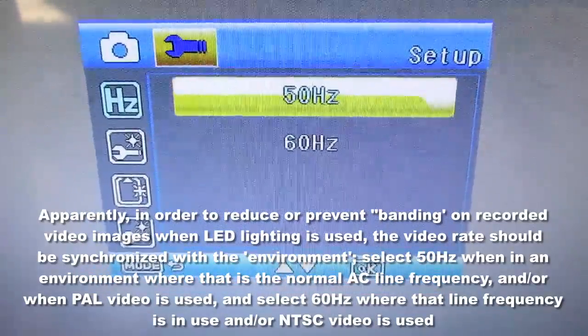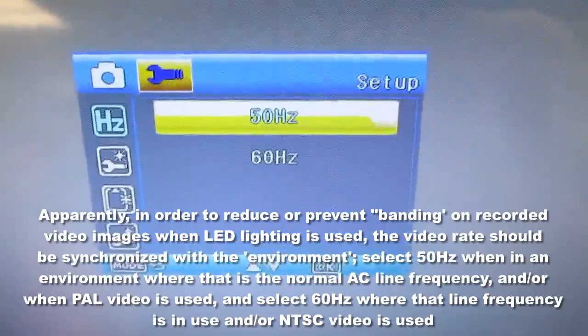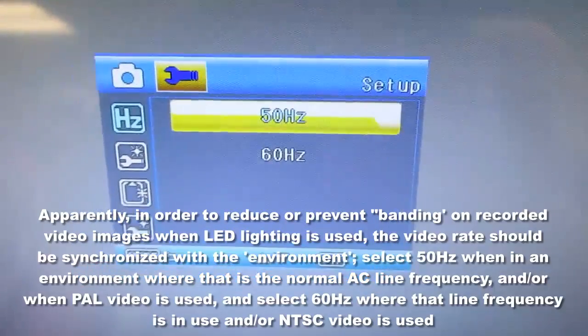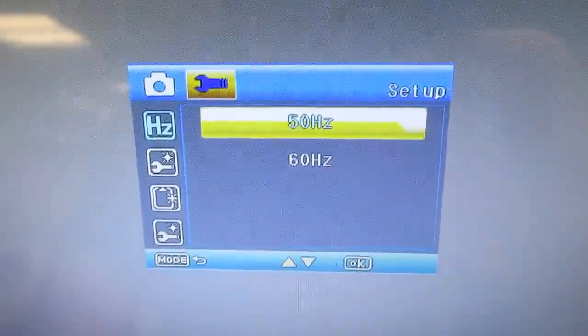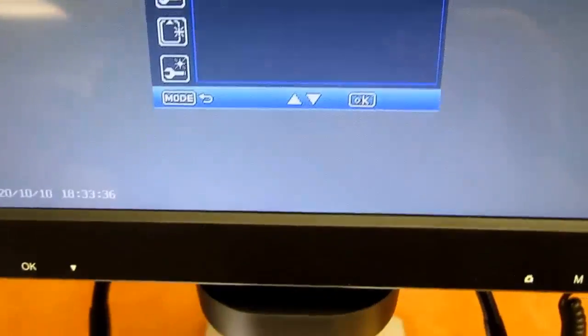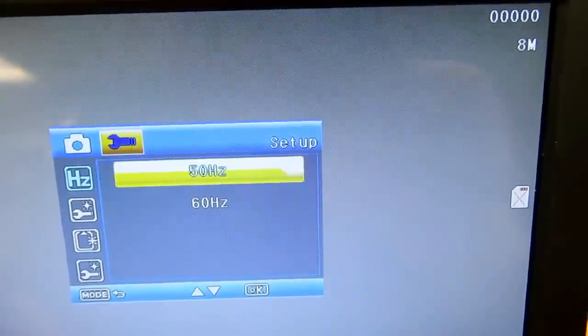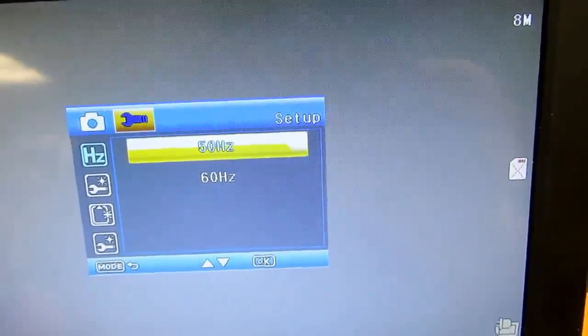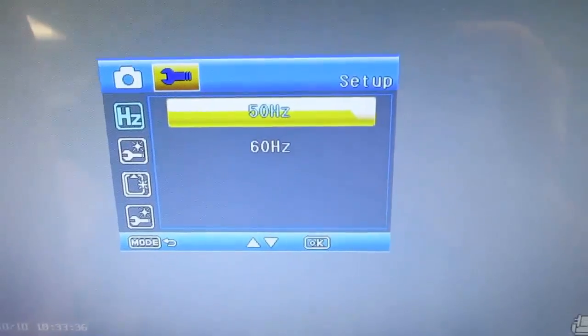And I go down some more. Is there more? Light source frequency. This lets you pick, I know I've seen this before. The manual doesn't describe it anywhere that I could see. But I think it has something to do with avoiding flicker or getting a beat frequency between the frequency of the lighting in the room and the frequency of, I don't know, I think if they're pulsing the lights here. They don't really mention it at all in the manual, so I'm inclined to just leave this alone for the moment. Line assist, off.